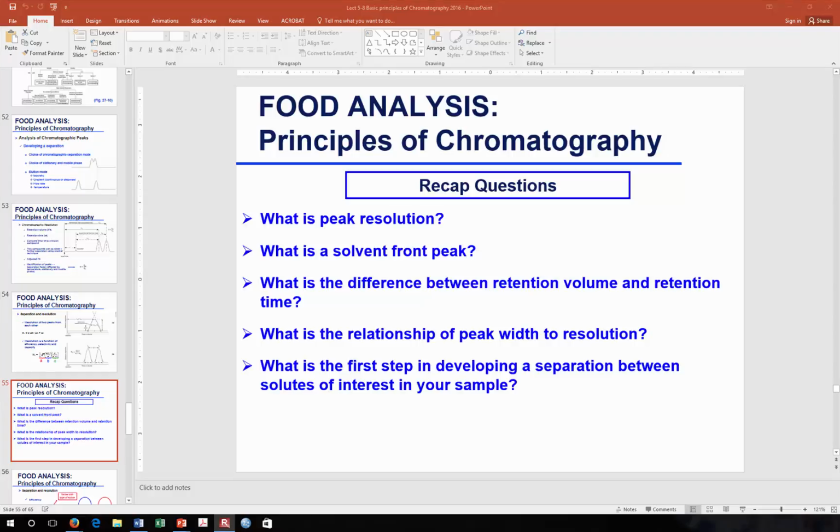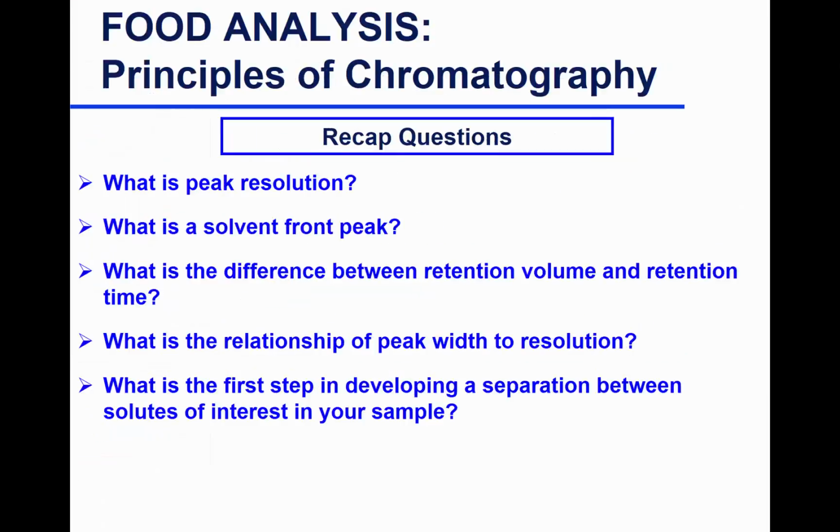And a little bit of recap so that we can continue where we left off last time. Okay. So what is peak resolution? Simply, when we say resolution, what does that mean? Okay, Drew? The separation of two peaks. 2 or 3 or 4, depending on how much. So resolution, it's how they resolve from each other, how you can separate them from each other. So you have a mixture of 2 or 3 or 4, how much you can get separation.